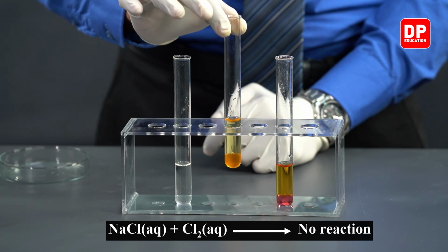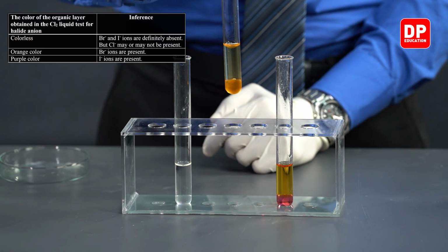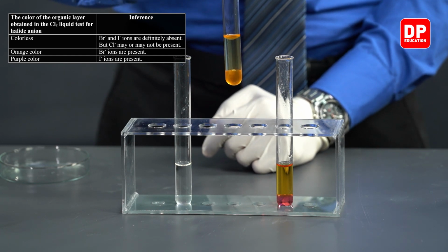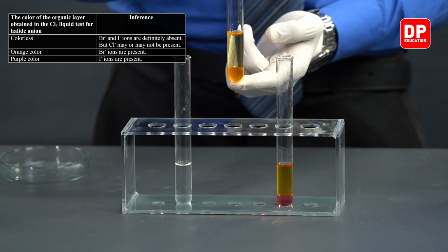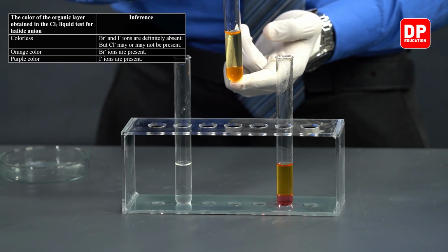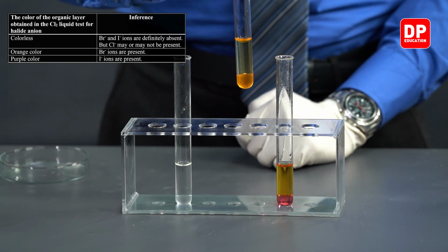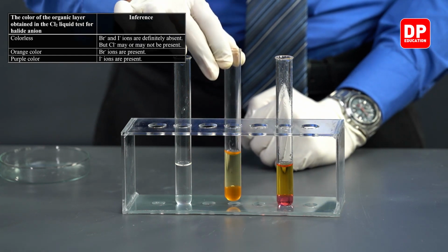When we conducted the chlorine water test to a bromide ion solution, we saw that bromine was displaced, and when bromine gets dissolved in the organic layer, the nonpolar organic carbon tetrachloride layer, we can see that layer turning orange. This is an indication of the presence of bromine, Br2.